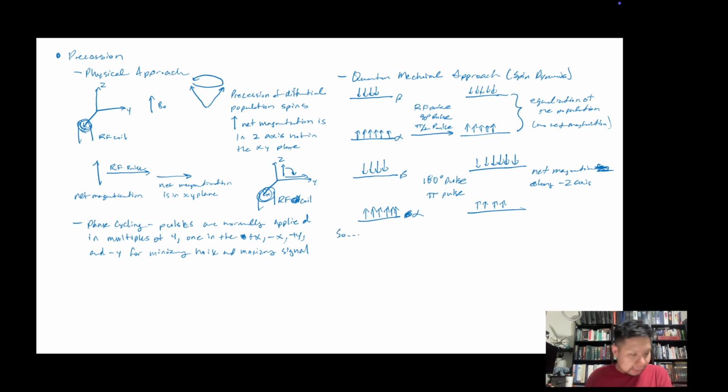So, right, we're still continuing on here. If we were to draw out our axes again, sorry, that one doesn't look as good as the other ones I've had. X, Z, and Y, right? And the RF coil is right there.